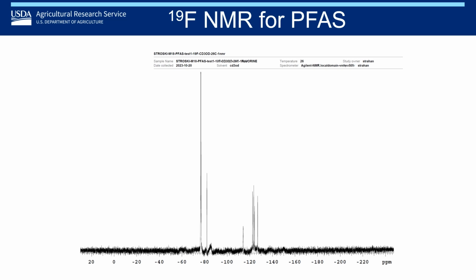way on the left actually indicates there might be some TFA or trifluoroacetic acid in the sample as well, which is a compound that is actually too short to measure with a lot of traditional targeted approaches. So this kind of wraps up our first case study looking into this interesting short chain kind of precursor compound.